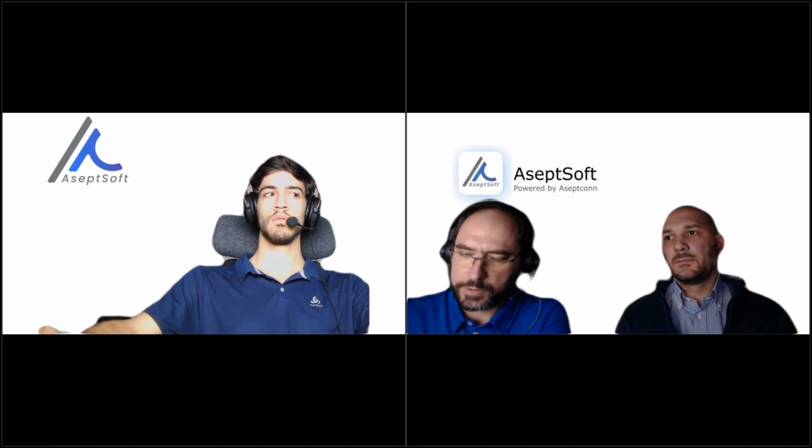Another frequently asked question is, if we have some existing projects in AutoCAD, could we use AseptSoft to design the process based on them? And which types of AutoCAD projects could be used?